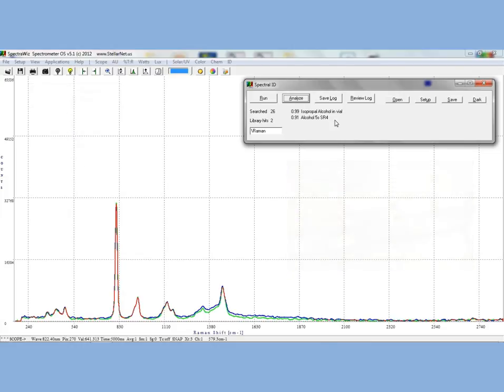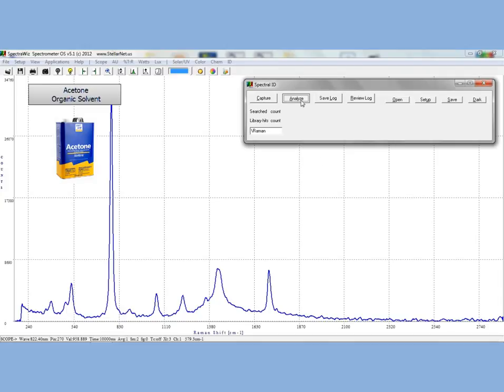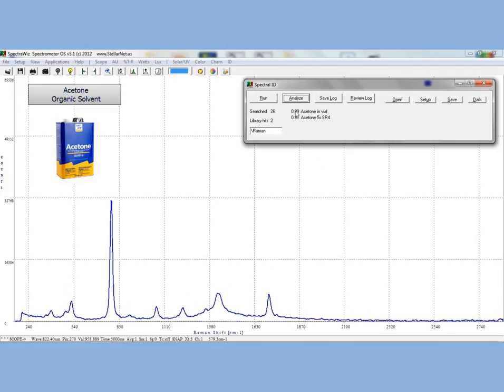Now, let's look at acetone. Go ahead and click the Analyze button again on the Spectral ID panel and we will see that the saved library spectrum matches the experimental once again. And by clicking the text on the library match, we can see the exact spectral overlay.